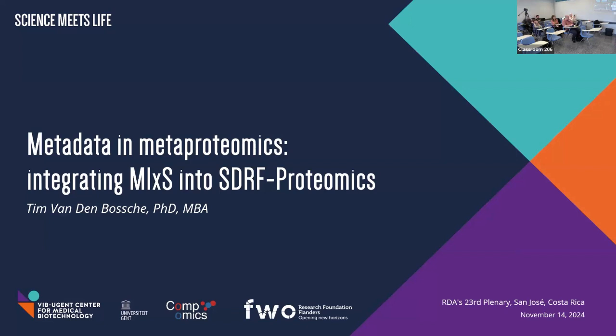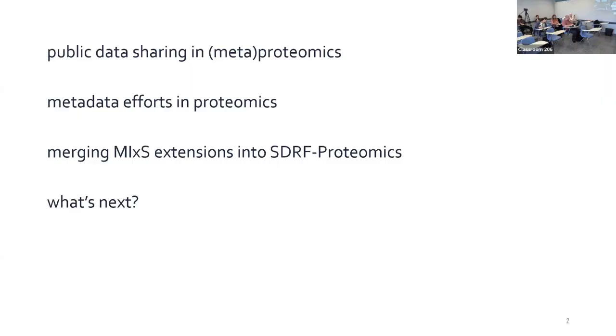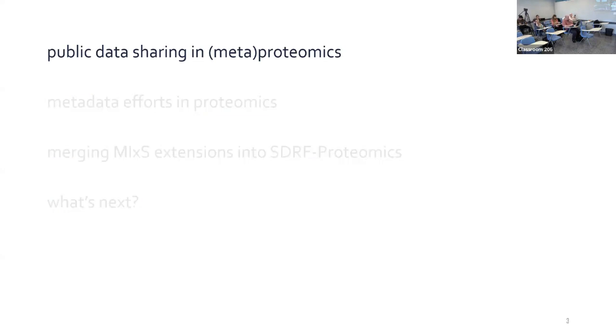So today I will talk about how I'm currently squeezing metagenomics metadata terms into proteomics. So I'll talk about public data sharing efforts in proteomics and metaproteomics, the metadata efforts in proteomics and metagenomics, and what we can do next.